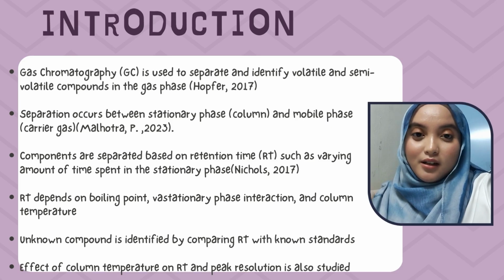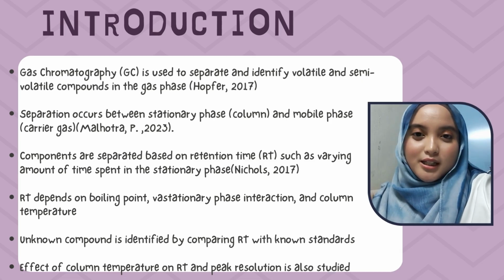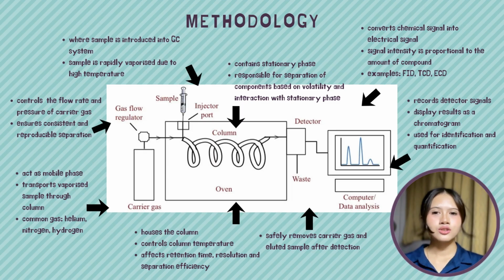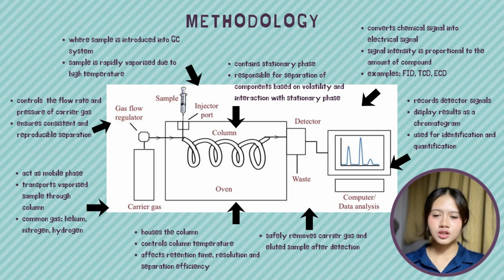By comparing the retention time of the unknown sample with known standards, we can qualitatively identify the unknown compound. We also studied how column temperature affects retention time and peak resolution, because these factors are important to obtain good separations and accurate identifications in GC analysis. Now, let's look at the how behind the science. This diagram illustrates the methodology and instrumentation of a gas chromatography system, which allows us to separate and analyze complex mixtures with high precision.